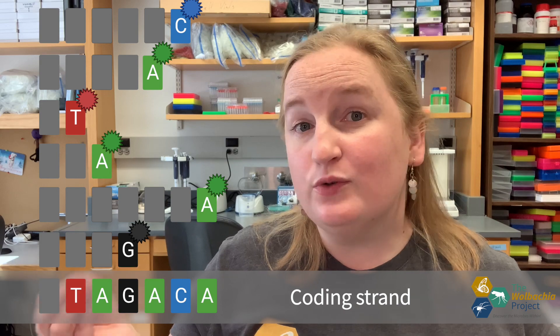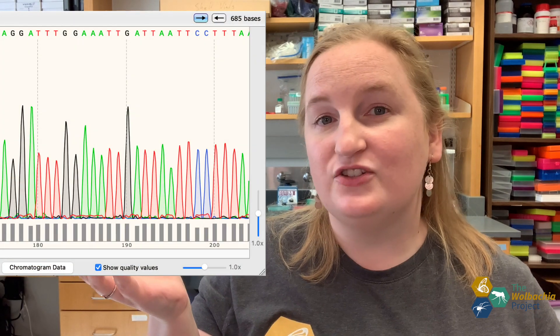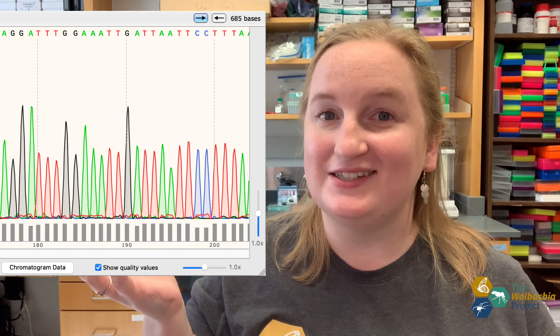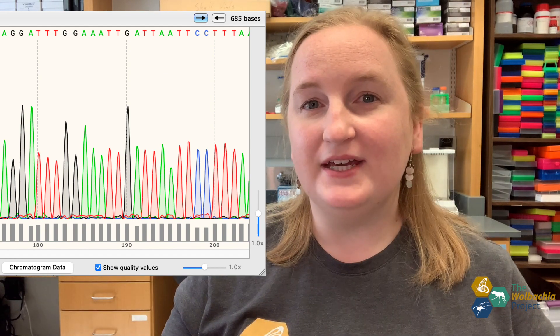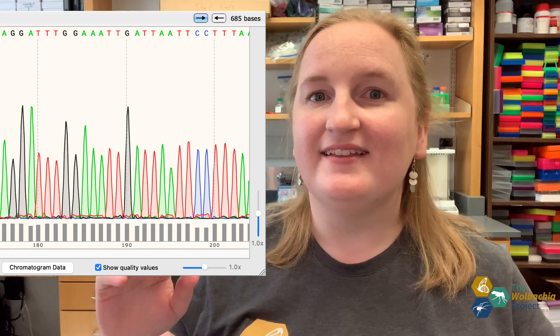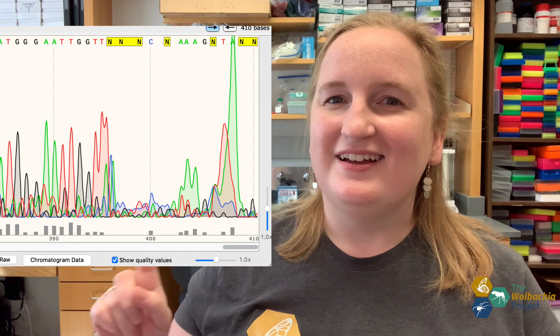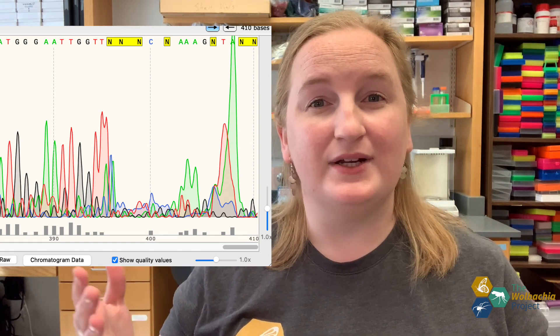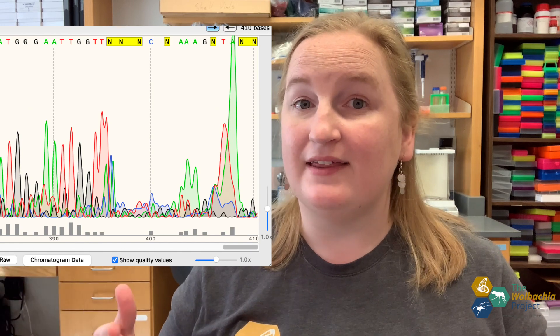A sequence run that uses fluorophores generates a result like this. This chart is called a chromatogram, and it's a lot like the gels that scientists used to run. When the peaks are tall and defined, that's a great sign — it means there's a clear and defined signal, kind of like having a nice bright band on a gel. But when the sequencer is picking up two or more fluorophores, it means it's reading multiple different nucleotides at that location.